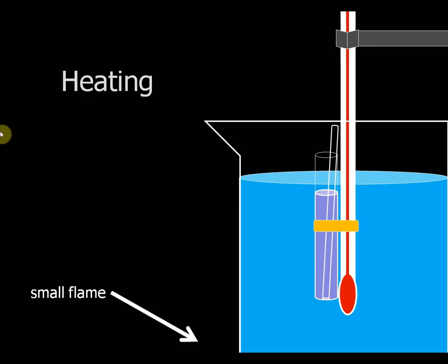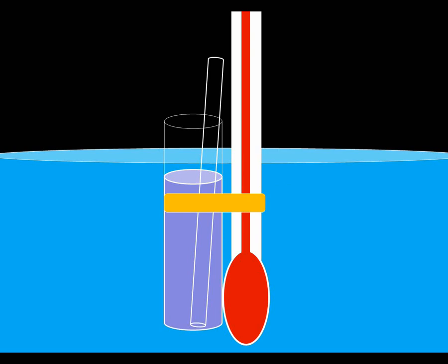All right, heat it up. And ironically, if you heat it up slowly using a smaller flame, it will save you time. Because remember, what we're doing here is going past the boiling point. If you heat it up really fast, it's going to go way past the boiling point, and you're going to be sitting there waiting longer for it to cool down. Okay, again, unknown is under the water. For this part, you can use tap water.